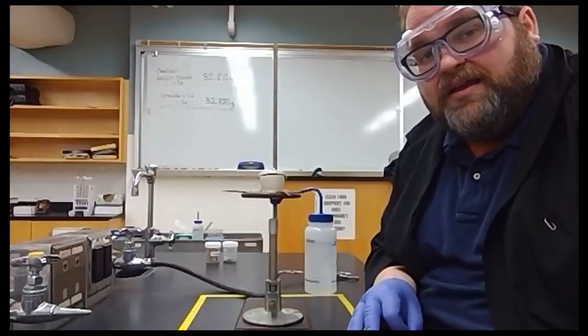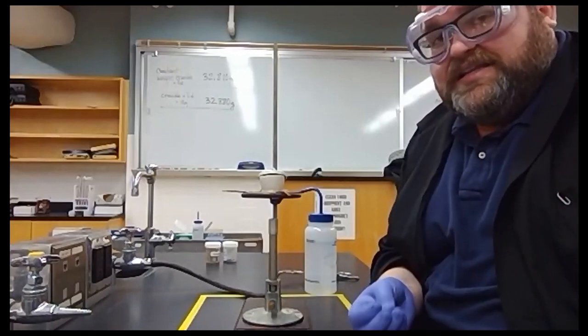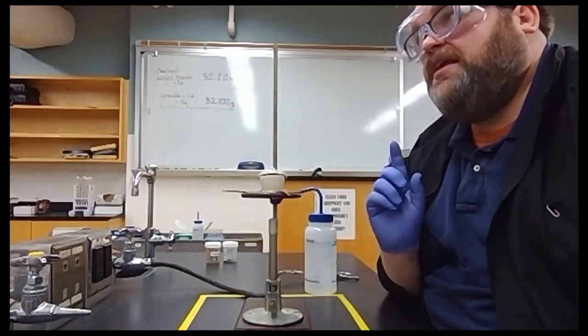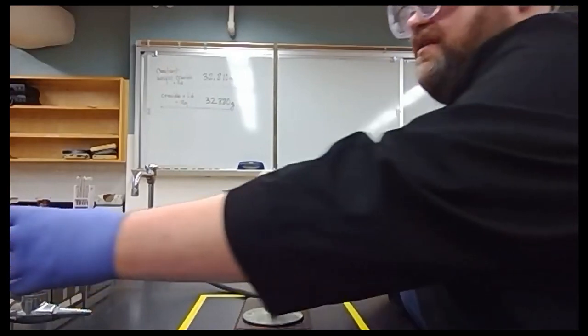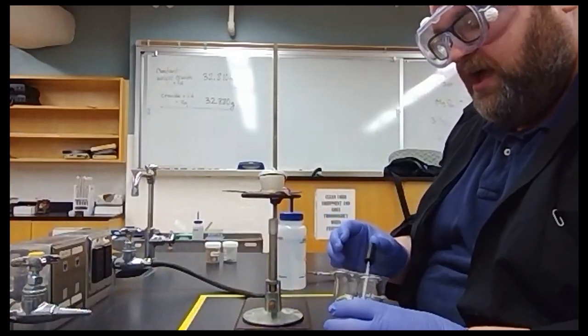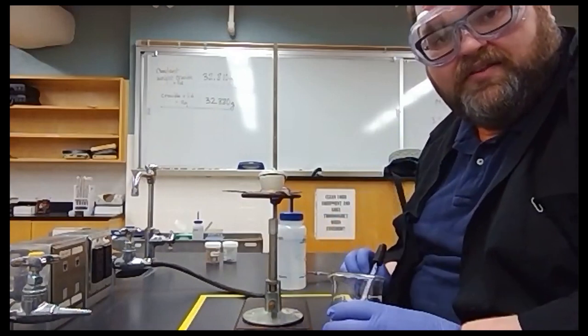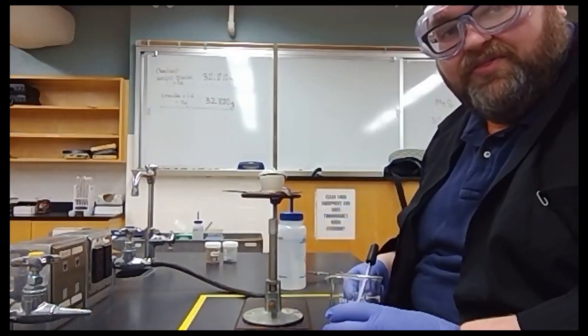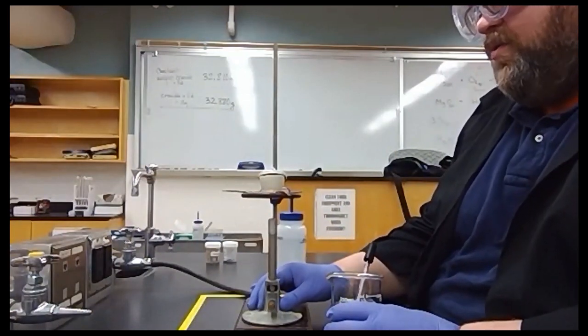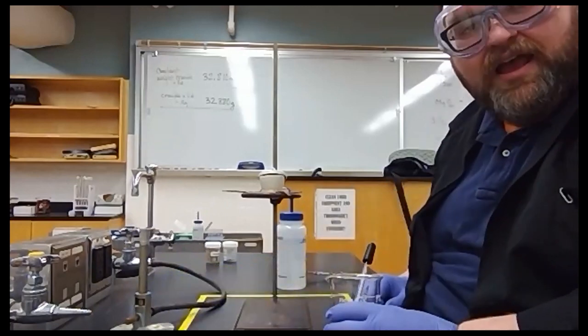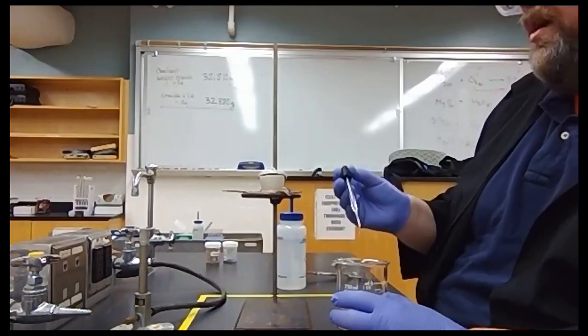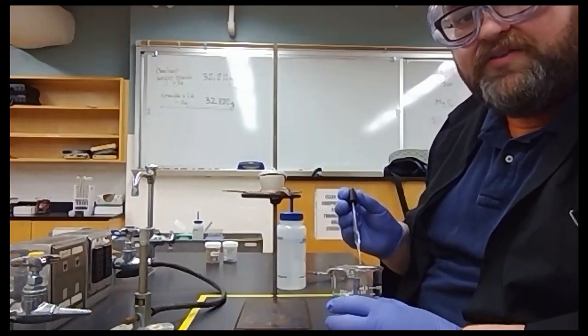We're going to add some deionized water to it. The deionized water is going to convert the magnesium nitride to magnesium hydroxide. Then we're going to put it back on the heat and we're going to convert the magnesium hydroxide to magnesium oxide. First, I don't want this to flash or anything so I'm going to move the gas out from under that. I'm going to give this a second to cool down a little bit.